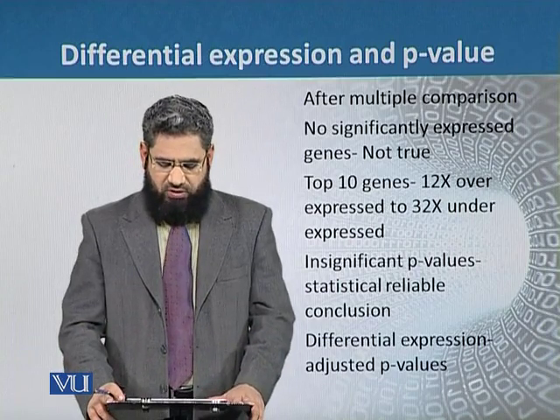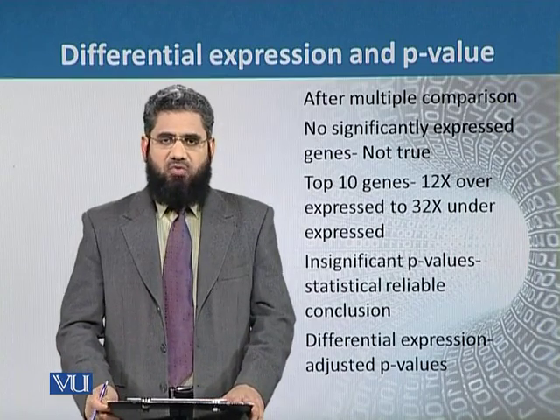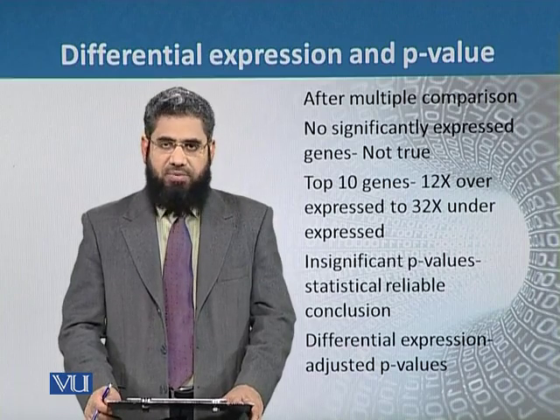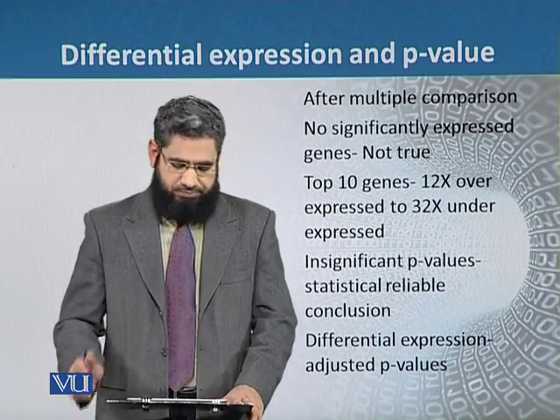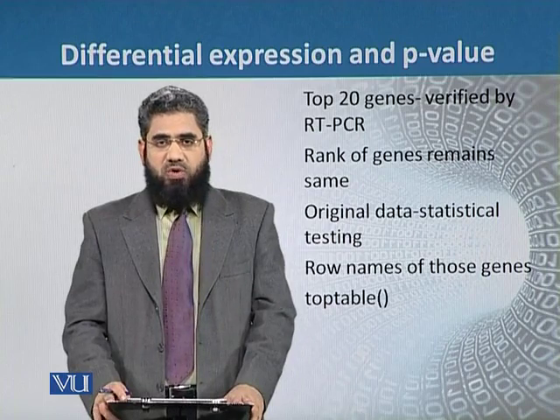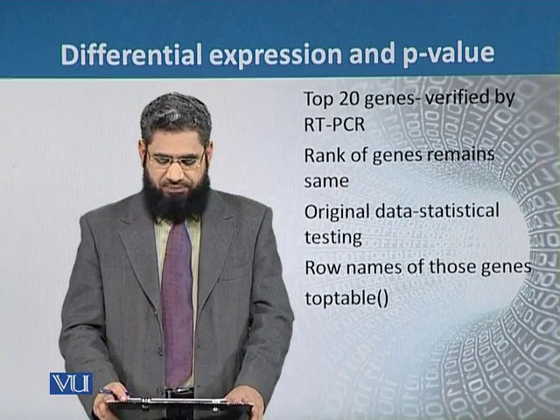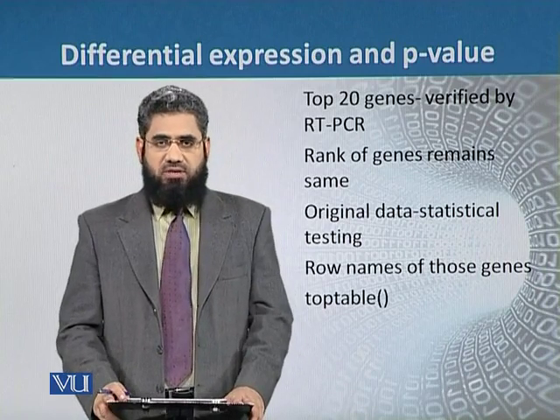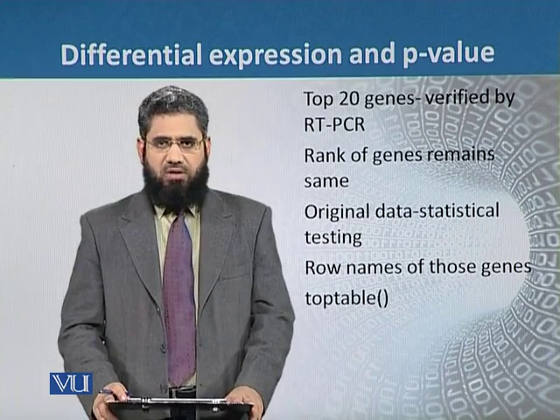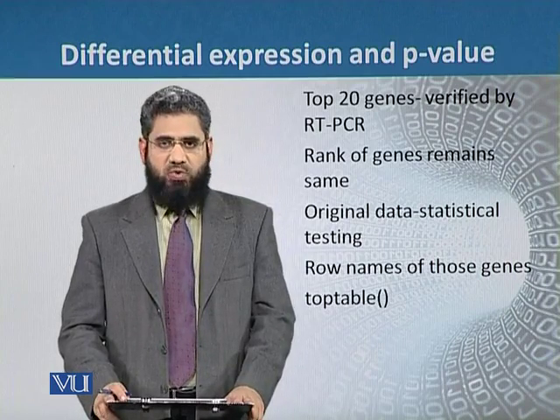But if our target is to see the differential expression within the genes after the microarray data, then the p-values can be adjusted. For example, if we want to see the expression value of the top 20 genes, then we can use certain different methods to identify and to calculate the expression of the first 20 genes.